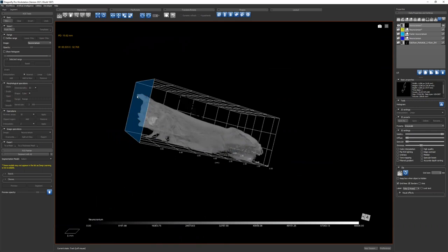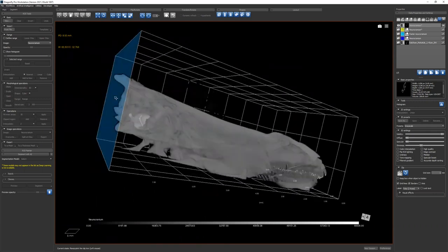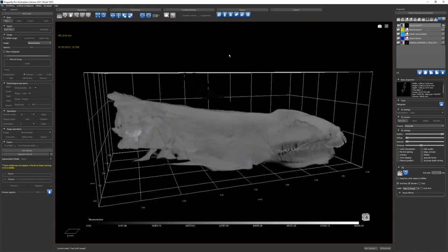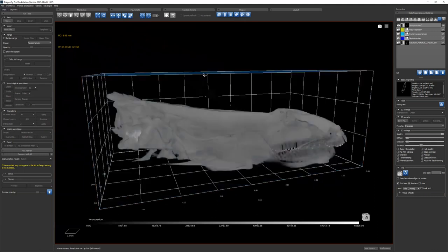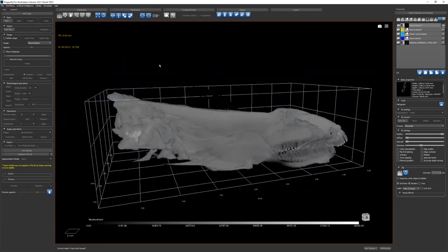You can watch it until it cuts in. Actually see when it starts to cut in there. Get really close as possible. You want to spend a lot of time here because when you use this later on and store it, you want this to be as small a file as possible.